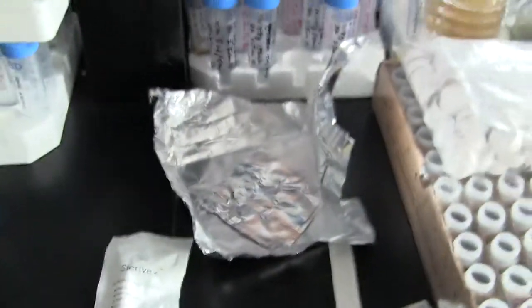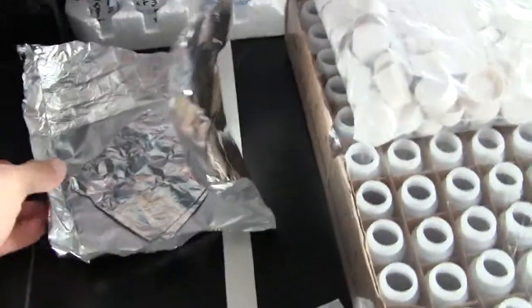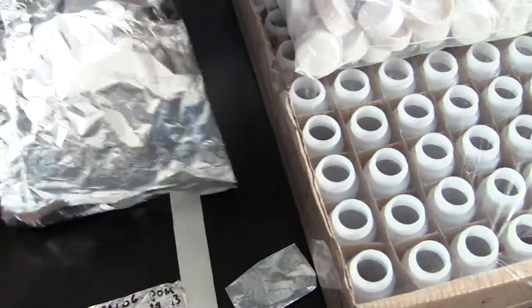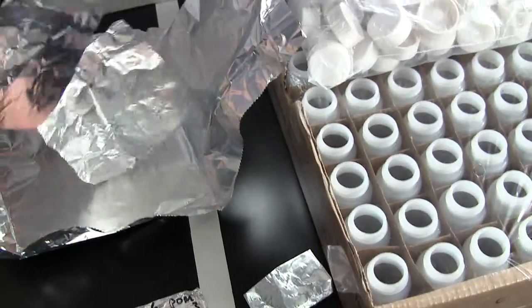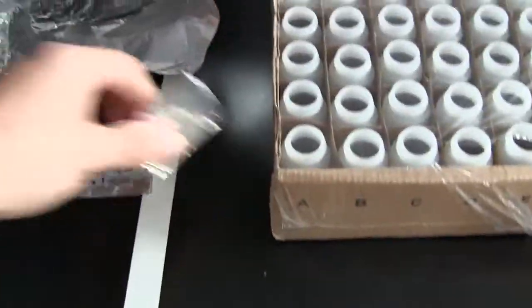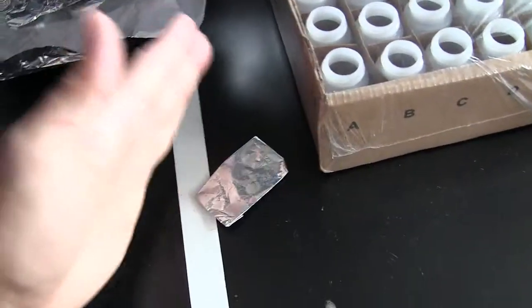Now, particulate organic matter samples, such as here, you always find that your filters will come wrapped in aluminum foil in a little envelope. You open the envelope, there are filters in there. Also, the aluminum foil you'll use to wrap your filters comes in a little aluminum envelope as well. What you do is, not using your hands, you pull out a new sheet of aluminum foil, you put your filter in it, you fold it into a little envelope again by folding the sides in, and then top down.